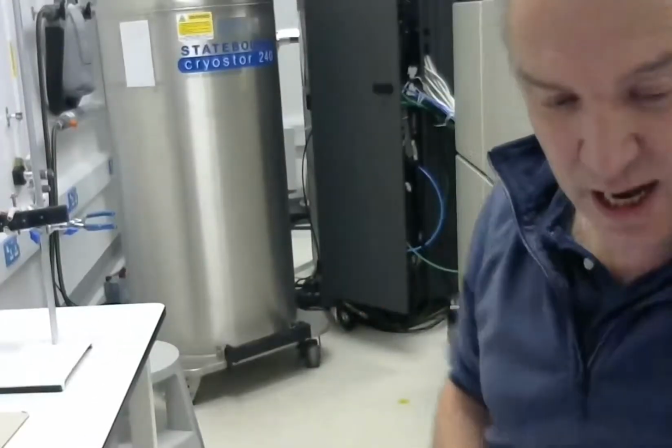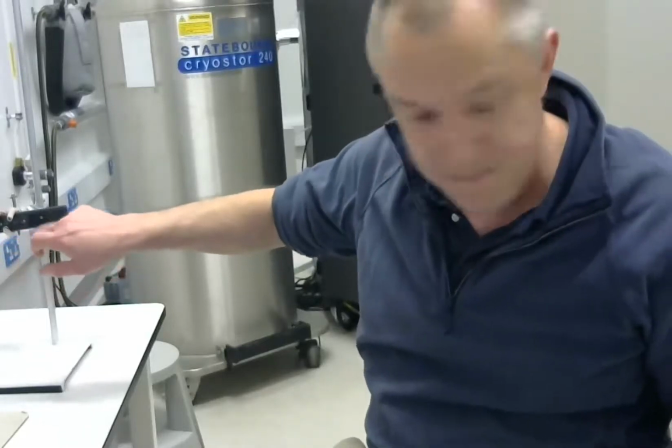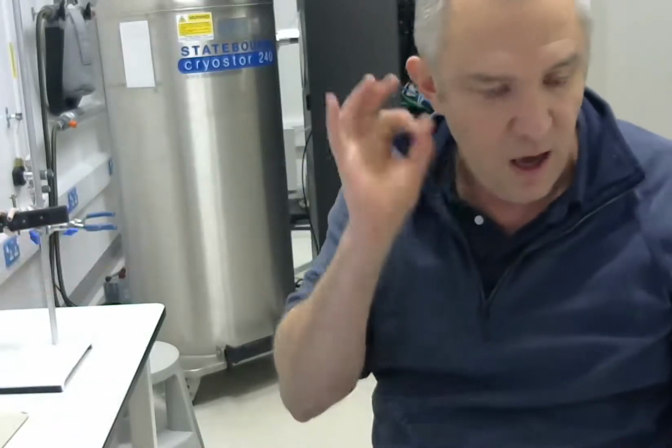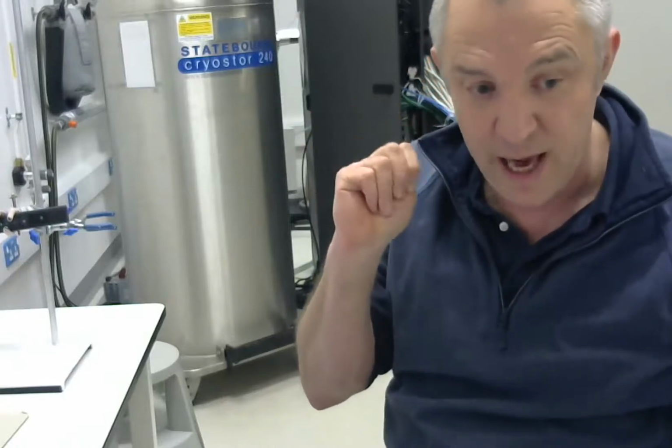What we've got over here is a laser pointer, just the sort that you would use for a talk if you were giving a talk. And then down here, we've got a slide, and in it we have a metal circle, which I'll show you in a minute, close up what that looks like. And it's just a grid of spacings.